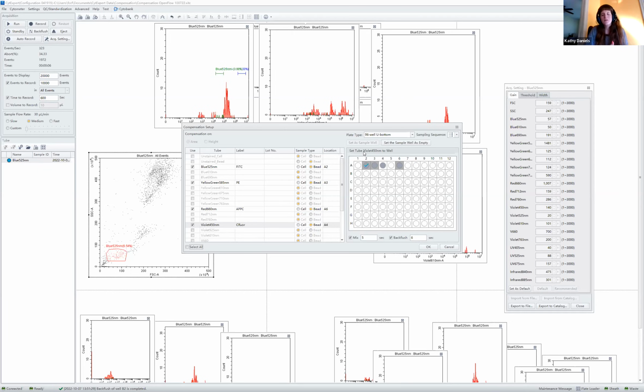But then logistically, you have to clean in tube mode and plate mode. So to try and make things a little bit easier, that's why I've swapped to this method most recently. If you set everything up in tube mode, the first tube that you run, just have that be your fully stained experimental sample, and then overwrite it once you've gone ahead and optimized all of your gains with whatever the true tube was, that's your first tube in your sample list. But it's very easy to do it in tube mode as well, and even easier than it would be here.